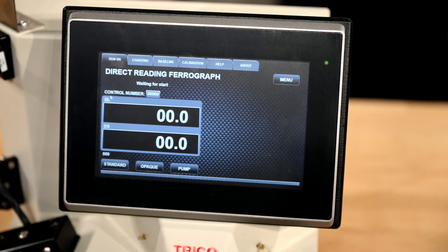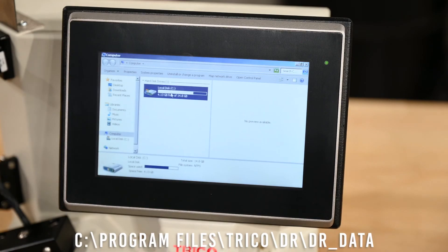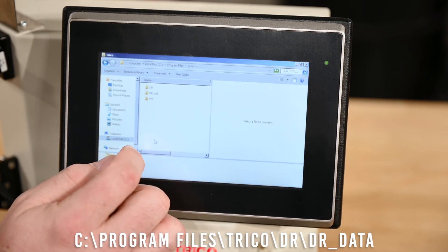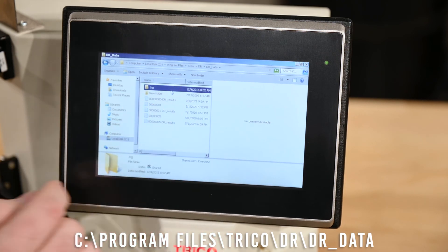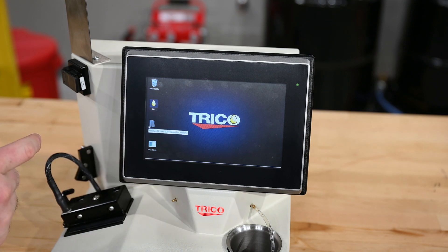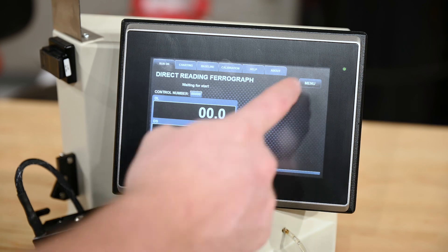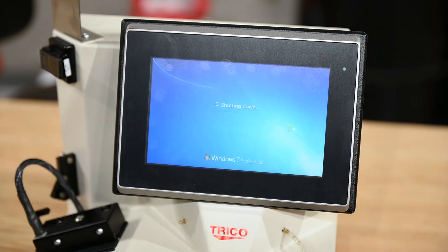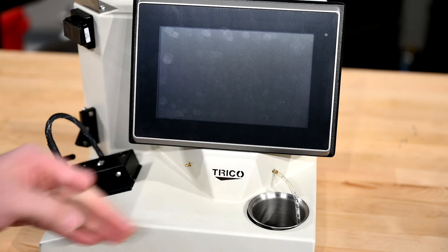To get to the CSV file with all the data, you exit the Trico program, bring up the start menu, open the C drive, go to Program Files, then open the Trico folder, go to the DR program folder — in the DR data folder is where the CSV file is stored. You can make a shortcut on your desktop to find that folder easily. To shut down the unit, exit the Trico DR program and double click the shutdown icon. Once it's completely shut down, turn off the power switch in the back. You know the power is off when the Trico logo is no longer illuminated.